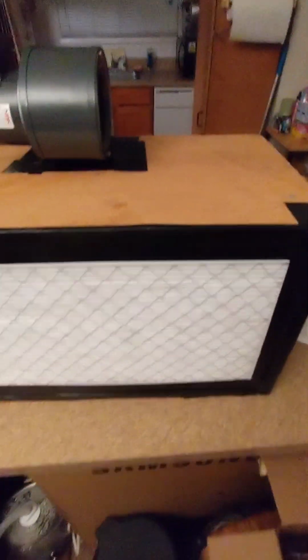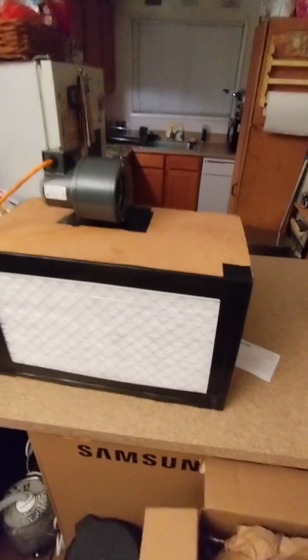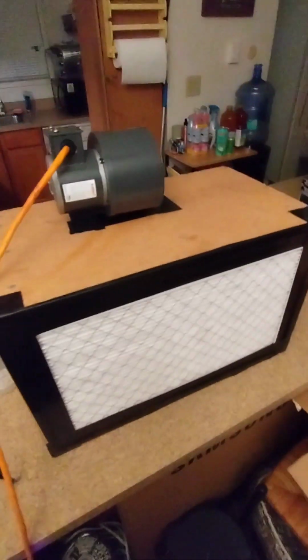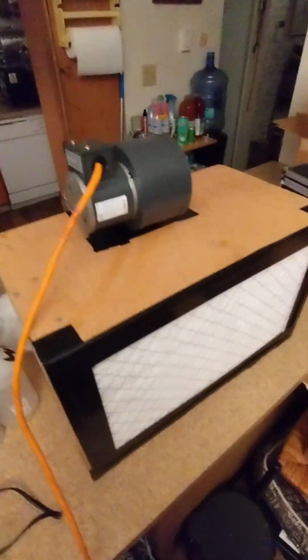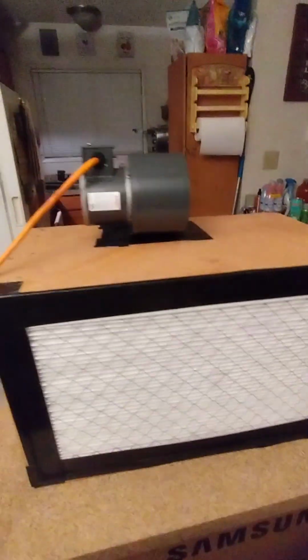Plug it in. You gotta wire the fan yourself, which is pretty easy. I know I could put some wood in front of here, but I just said forget it, tape it on, because I'm gonna replace them every once in a while. But there you guys go. Laminar flow hood.